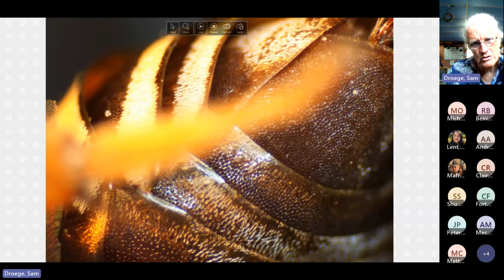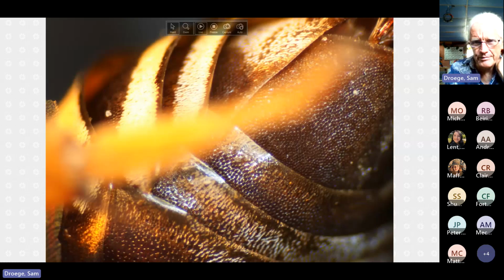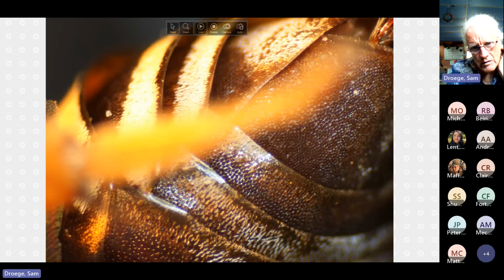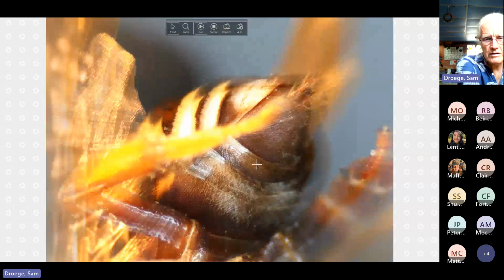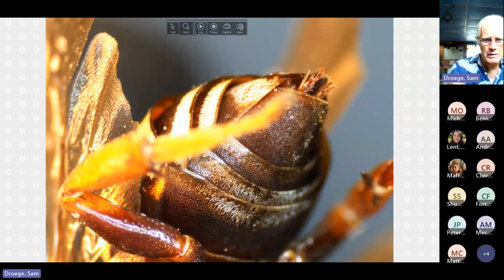And then on S2, it's a little bit mixed up with what appears to be some kind of dirt, like those things there, contamination, but there are some lateral white hairs in there. So that's what you're looking for when you're looking for those. Sometimes it's really obvious, and again, sometimes you have a specimen that is a little bit messed up.